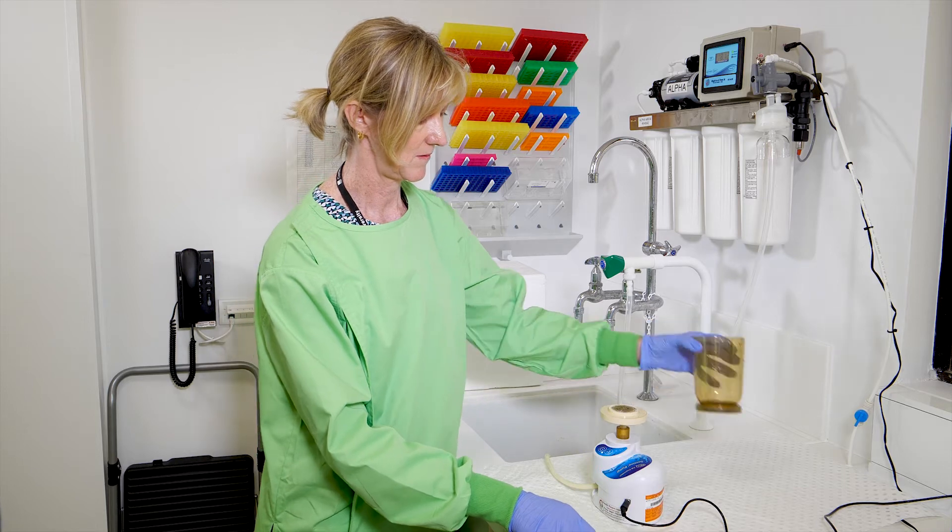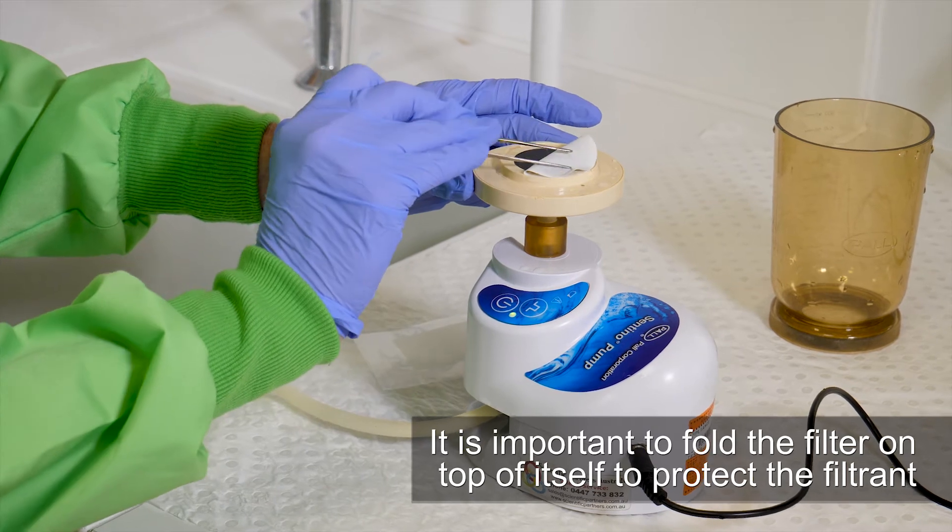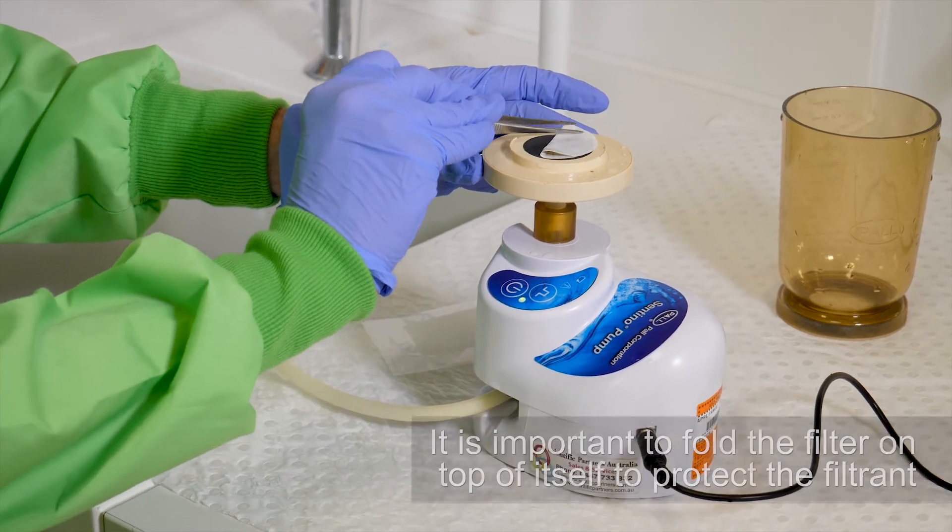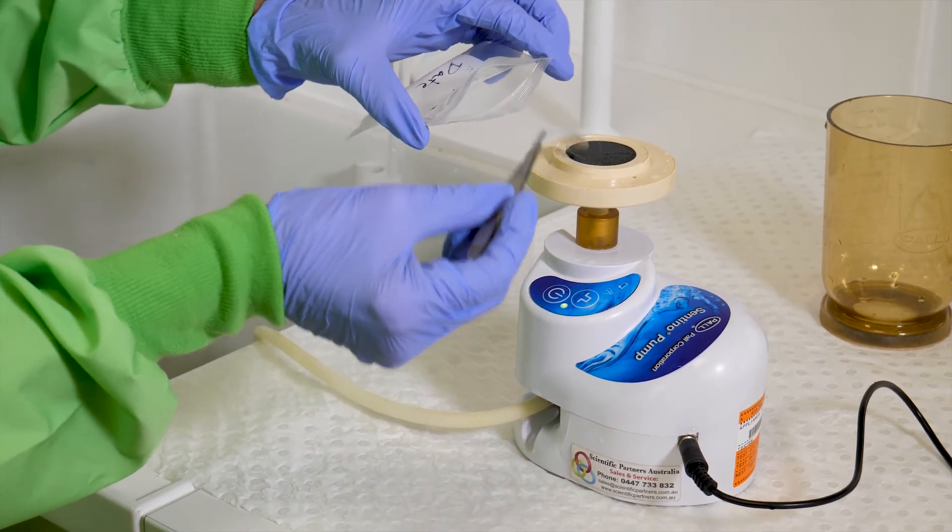Remove the funnel from the pump. Use clean forceps to fold the filter membrane on the base and crease it by pressing gently down. Place the folded membrane into a sample bag labeled with a unique sample name and the date.